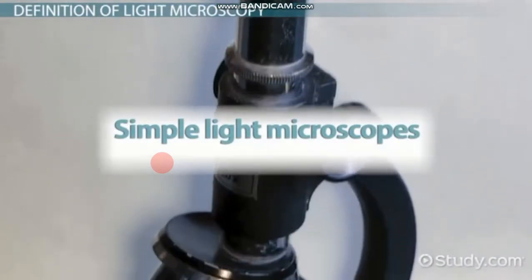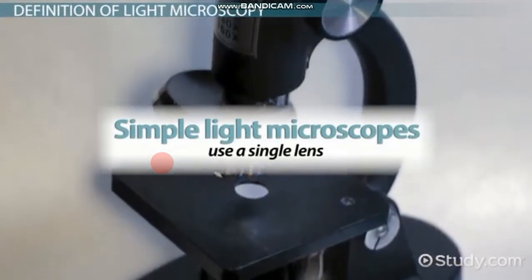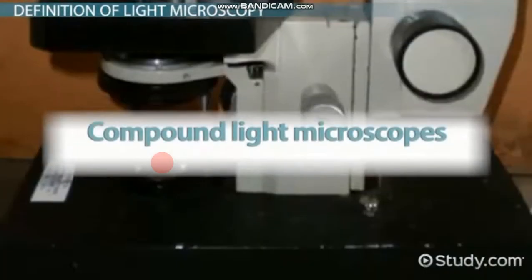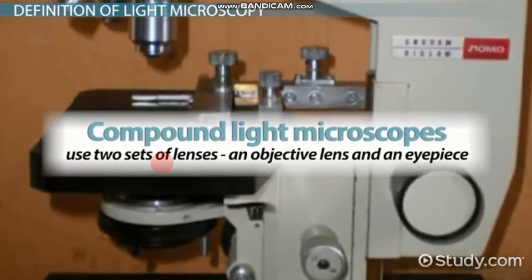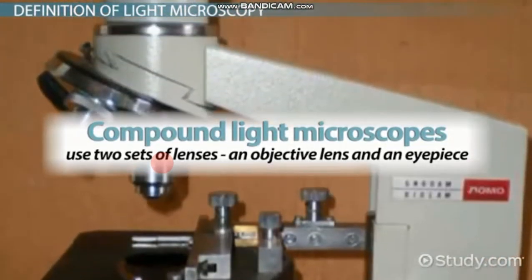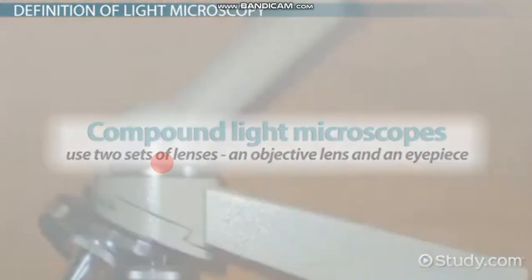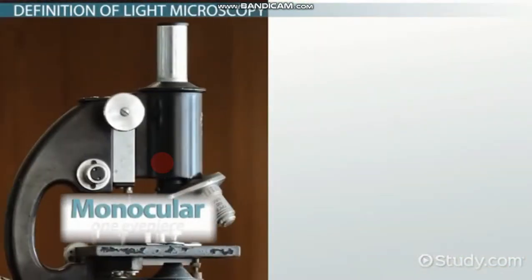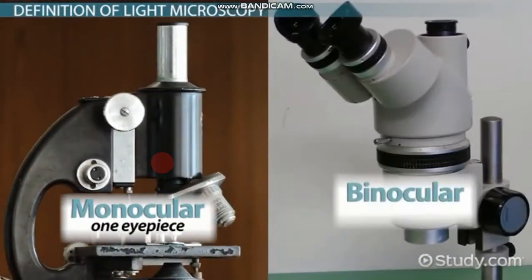Light microscopes can come in several forms. Simple light microscopes use a single lens to magnify an object and cannot reach high magnification. Compound light microscopes use two sets of lenses, an objective lens and an eyepiece, to produce images. Monocular microscopes have one eyepiece, while binocular microscopes have two eyepieces and reduce eye strain.